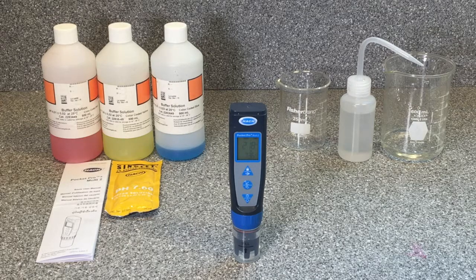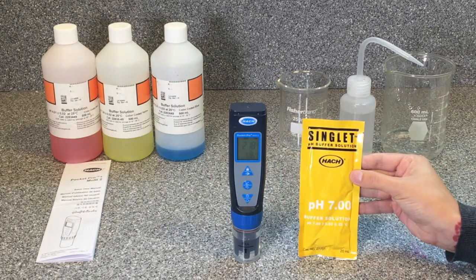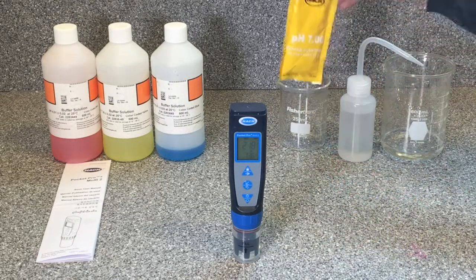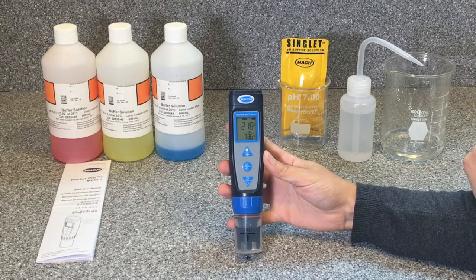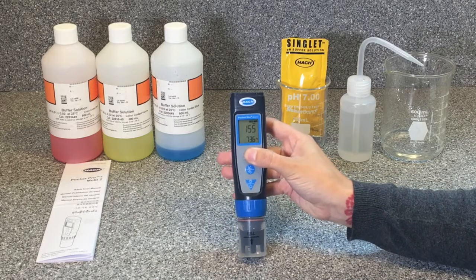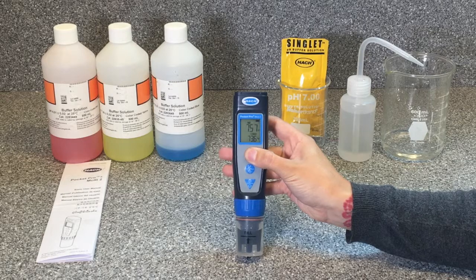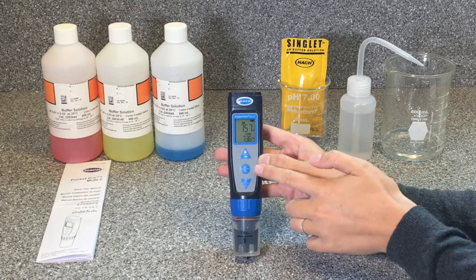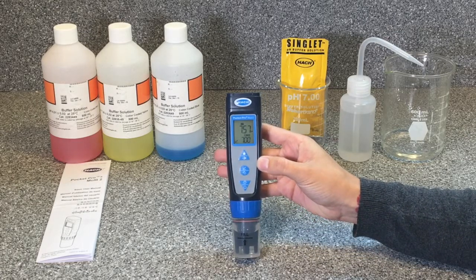Next, we'll do the initial calibration for pH — it's a very similar process. This is our pH standard, which is a solution with a known pH of 7. Open that up and set it aside. Use the arrow buttons until pH displays on the screen; make sure to hold the button until it advances to the next parameter. Once pH is shown, enter calibration mode by pressing the calibration button for a second. This is calibration mode for pH — it should show the calibration symbol.